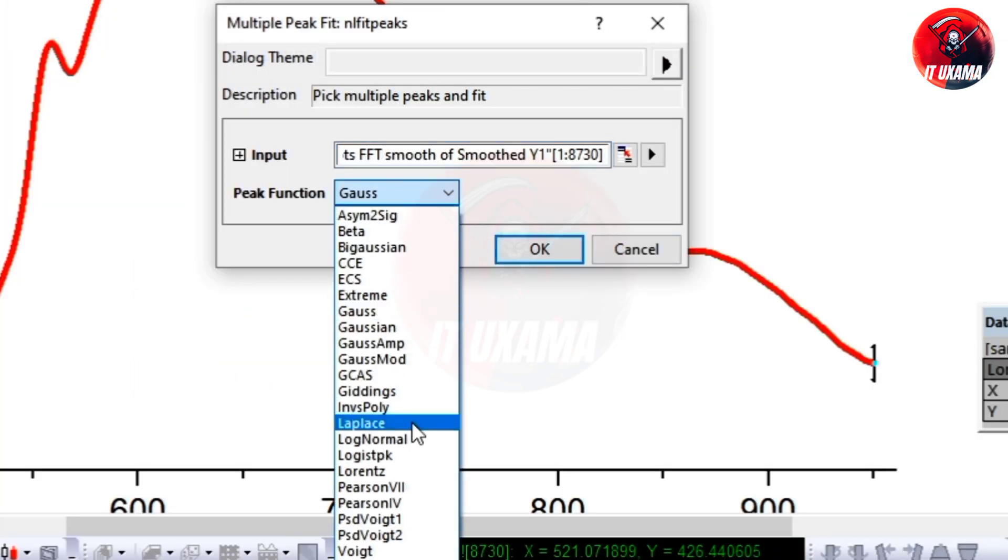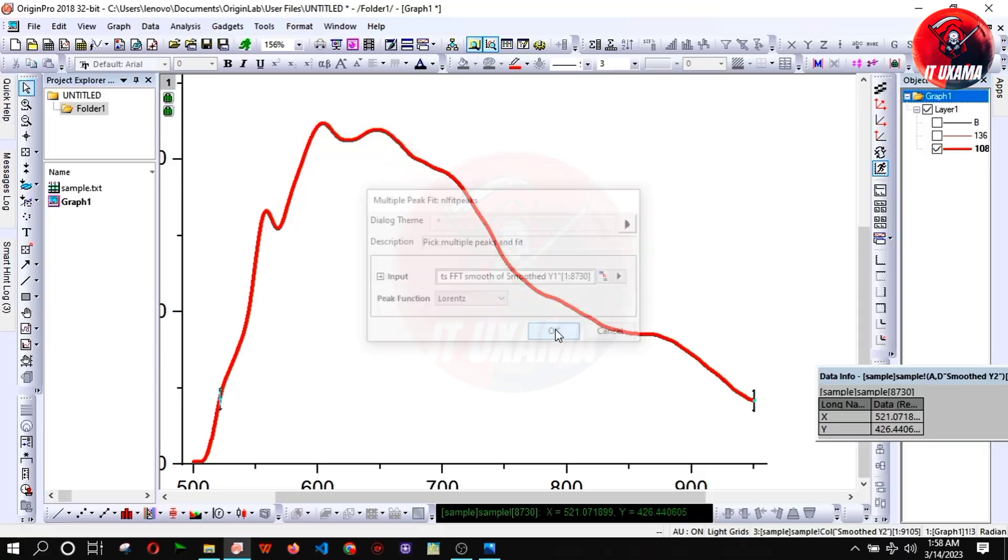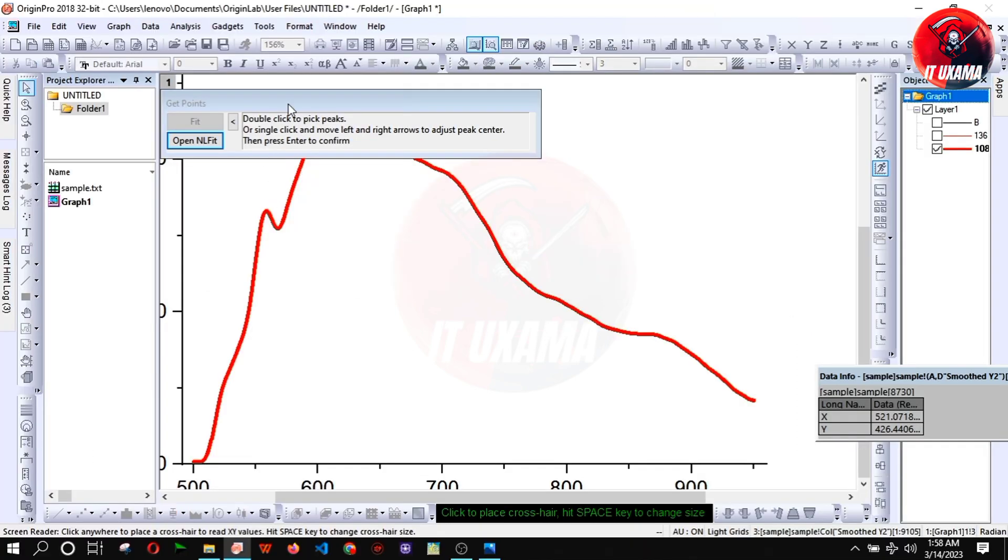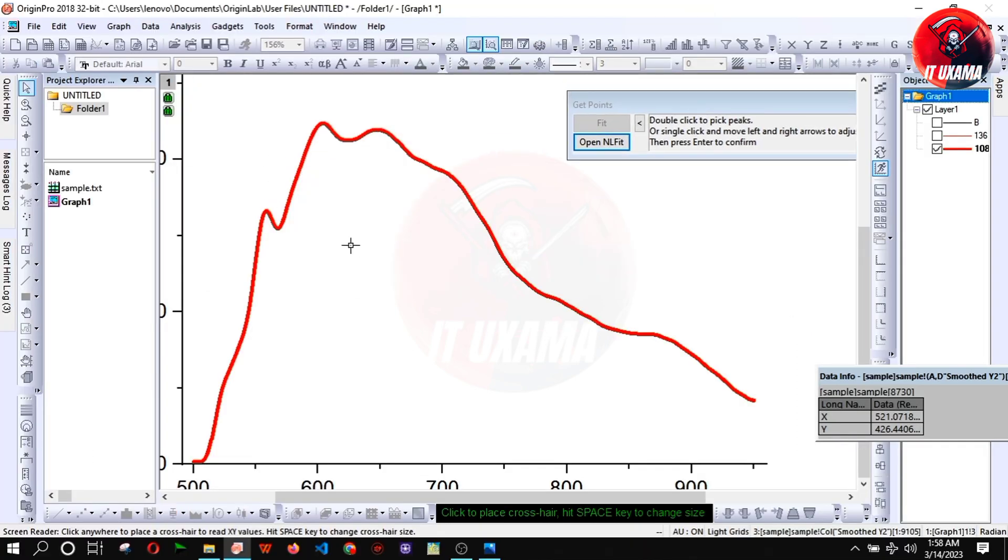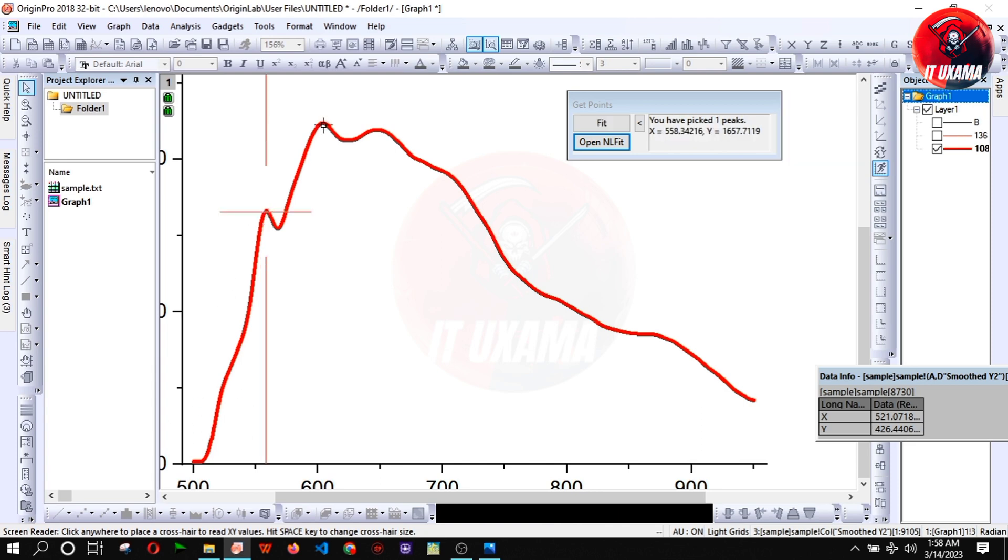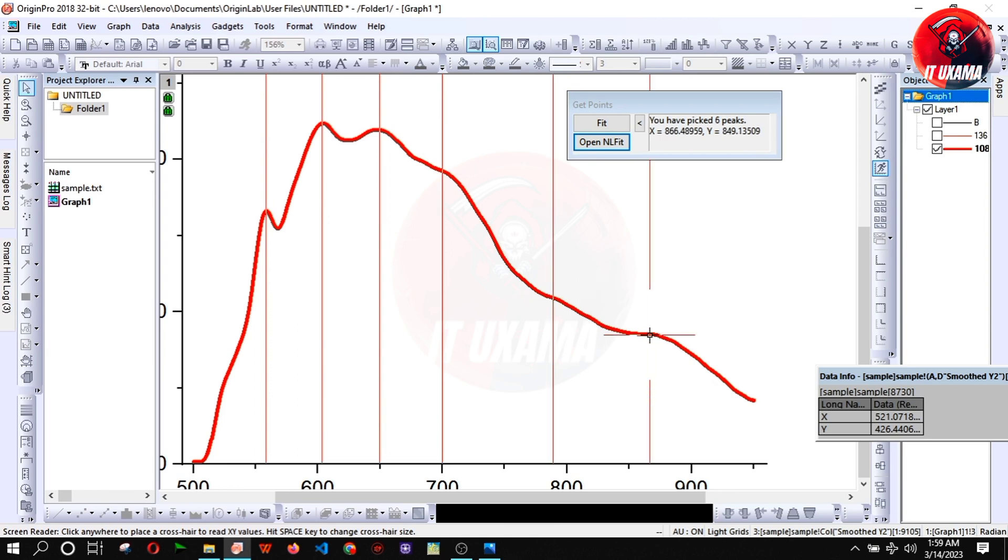Now you have options to use Gauss, Gaussian or Lorentzian fitting, they just have difference of equation of fitting. I'm using Lorentzian fitting. Now select all the peaks points in the curve. Here are six peaks I have selected.